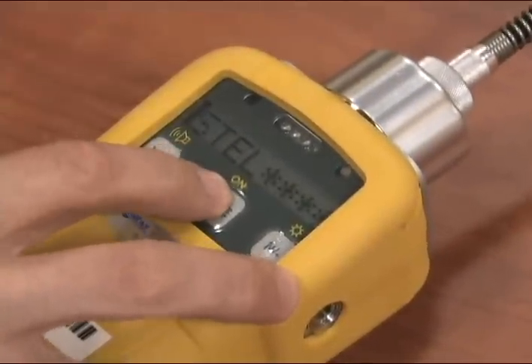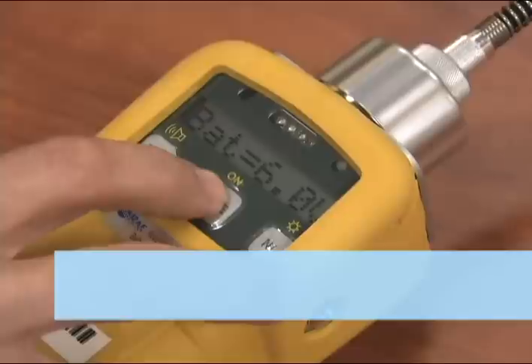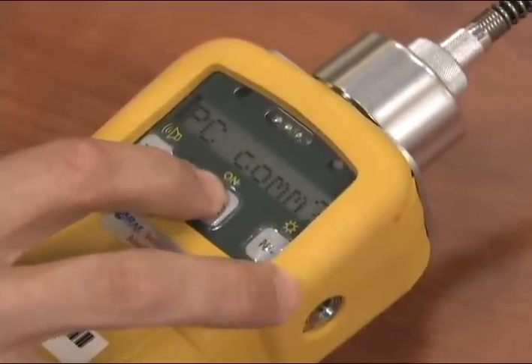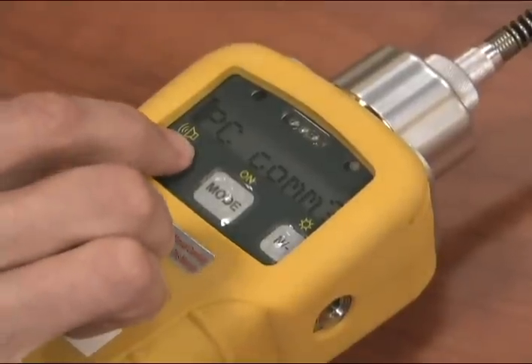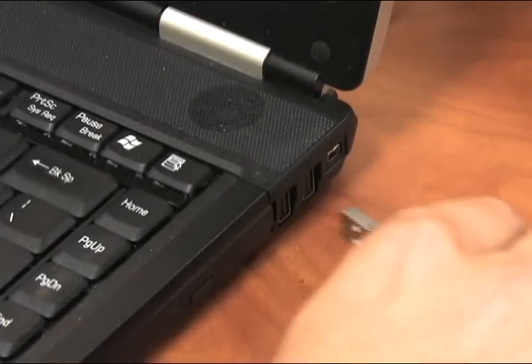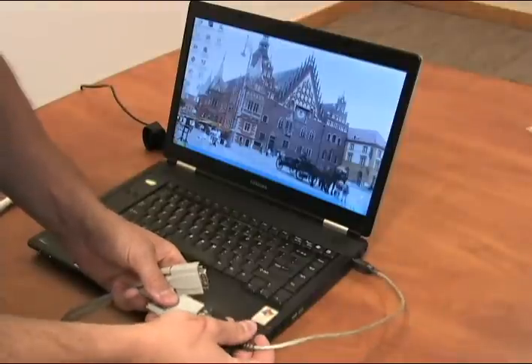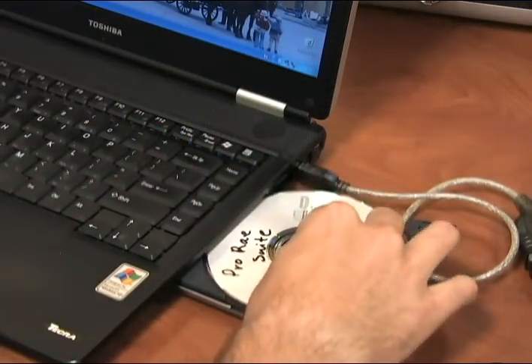When your sampling event is complete, you will need to download the data to a PC to print out a report. Galson Laboratories will download and print out your report on request. To do this yourself, press the mode button several times until PCCOM? appears on the screen. Push Y and "pause monitor?" will appear. Push Y again. Attach the data transfer cable to the bottom of the unit and to the COM port on the PC, with or without the USB converter cable.